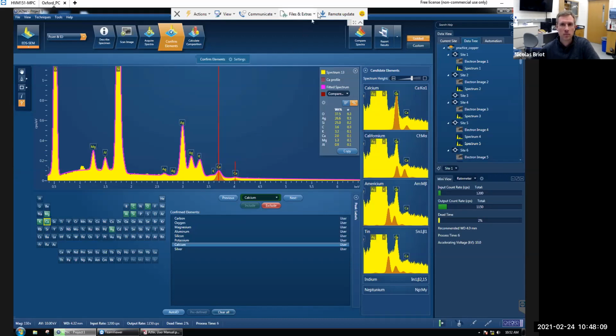Yeah, it just looks like it's not far enough to see on the cross section. Yeah, I guess the grinding probably broke that tiny region. Yeah, if it was 50 microns in, we should be able to see it, but we can't. Okay.